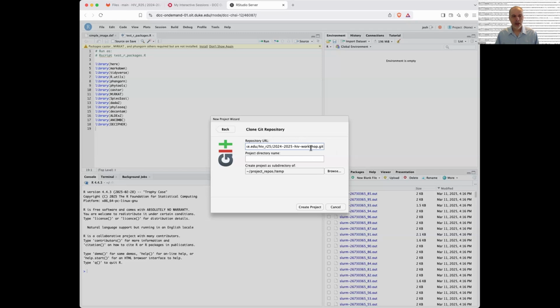Okay, great. So if your cursor is anywhere in there, and you push on the Shift key or the Control key or the Option key or the Command key, or I think even the Windows key will work. Maybe don't do the Windows key. Do Shift or Control. Then it will copy this last little bit here, and it's going to plug it into the project directory name. You can type it or copy it from here, but it's just easiest if you push Shift or Control or whatever. Anyone not get that?